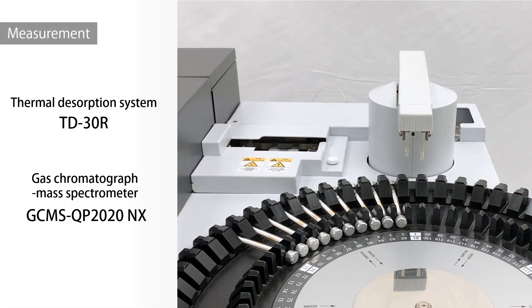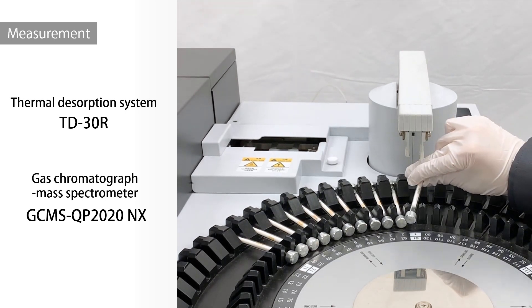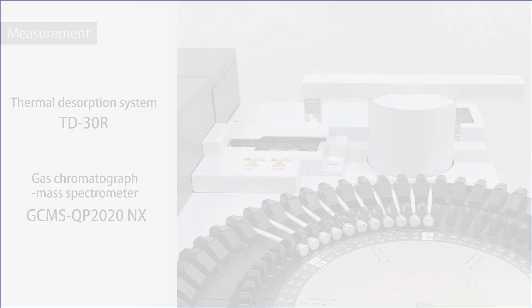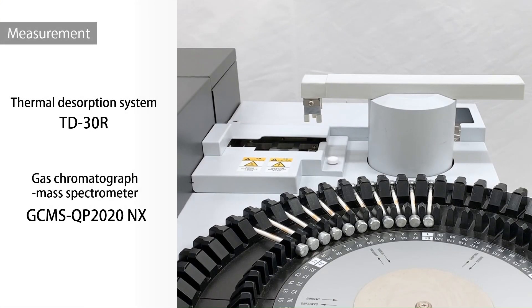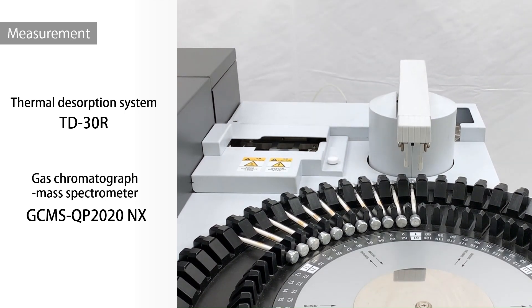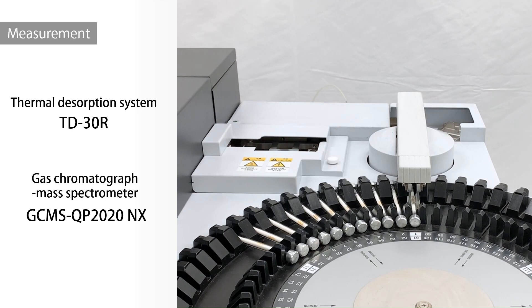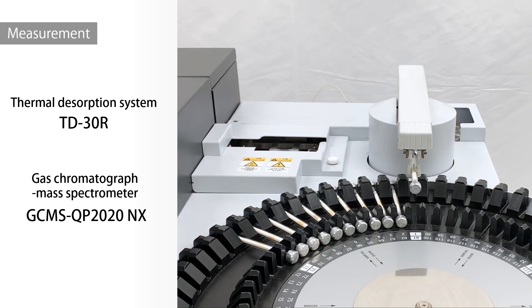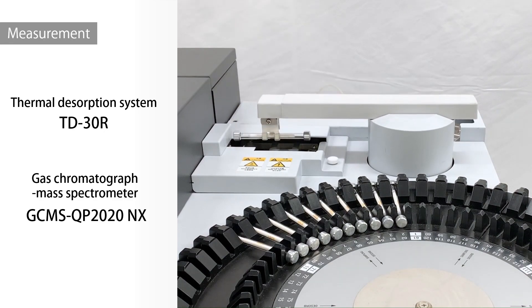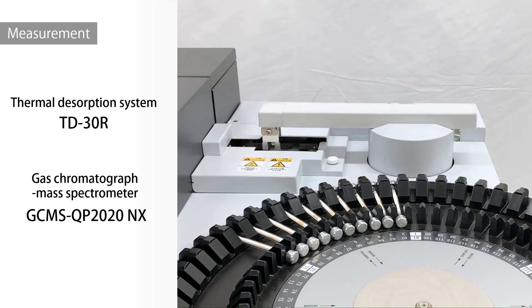First, a calibration curve was prepared with a toluene standard solution. The sample tube was set in the instrument. The auto-sampler is controlled by the software. Analysis started automatically when the auto-sampler placed the collecting tube in the heater. Once heated, the components adsorbed on the collecting tube were desorbed and introduced into GC-MS.